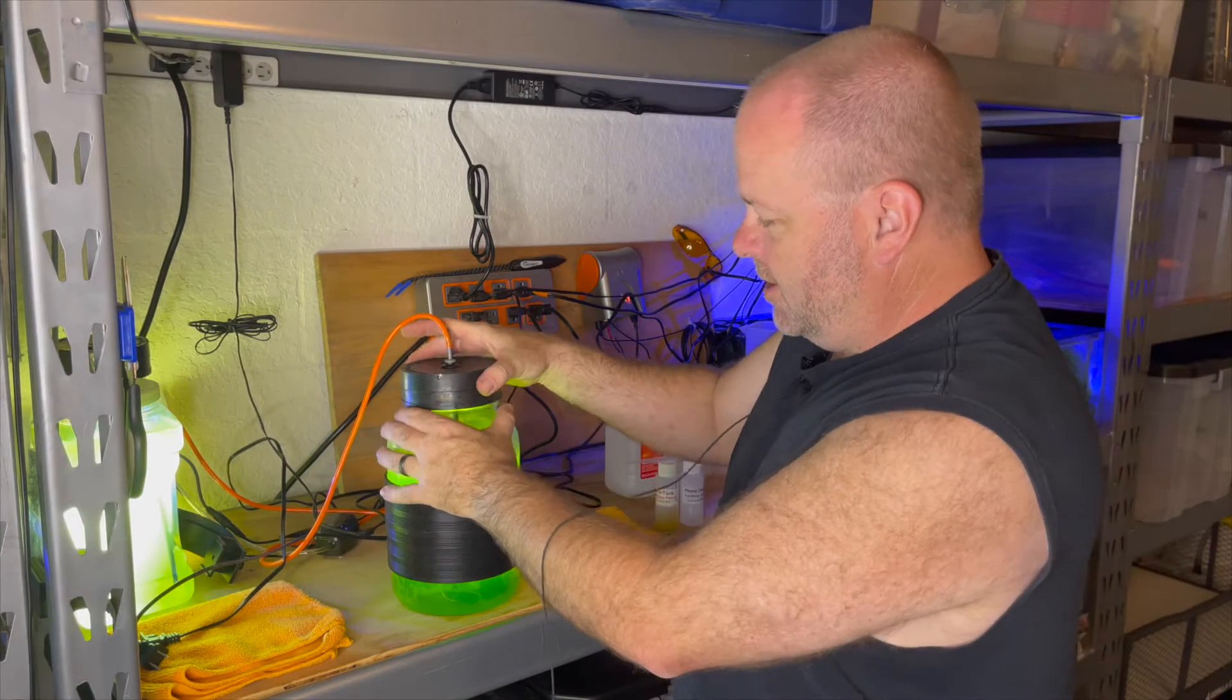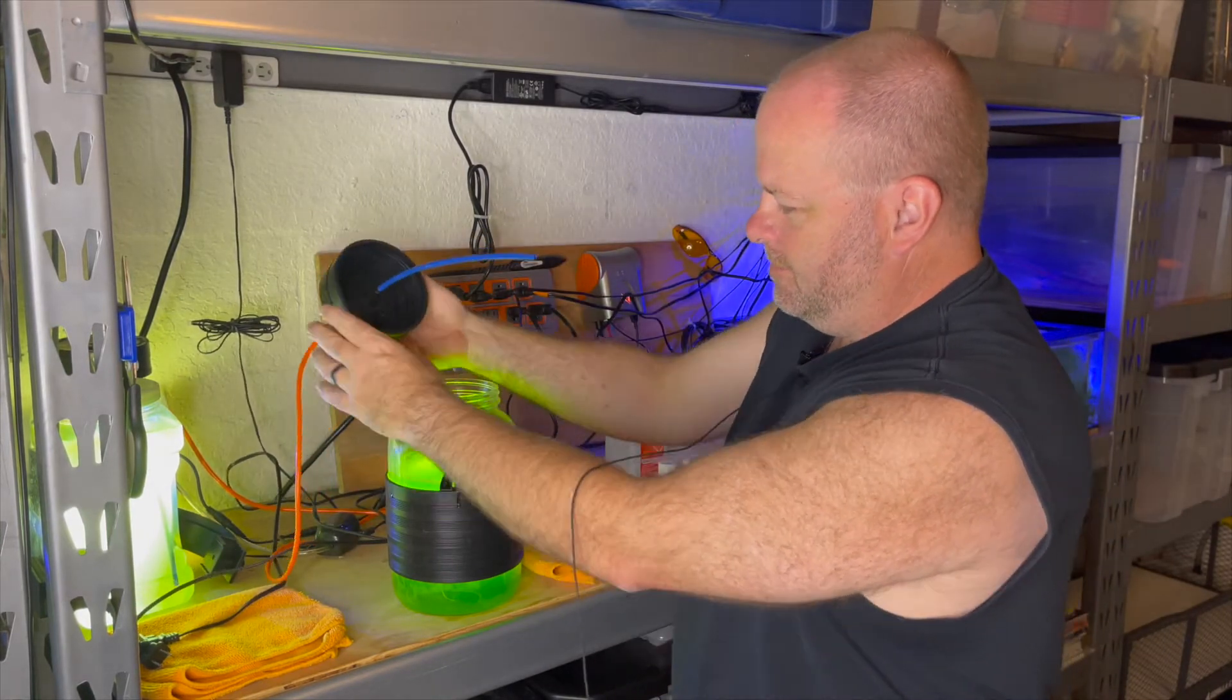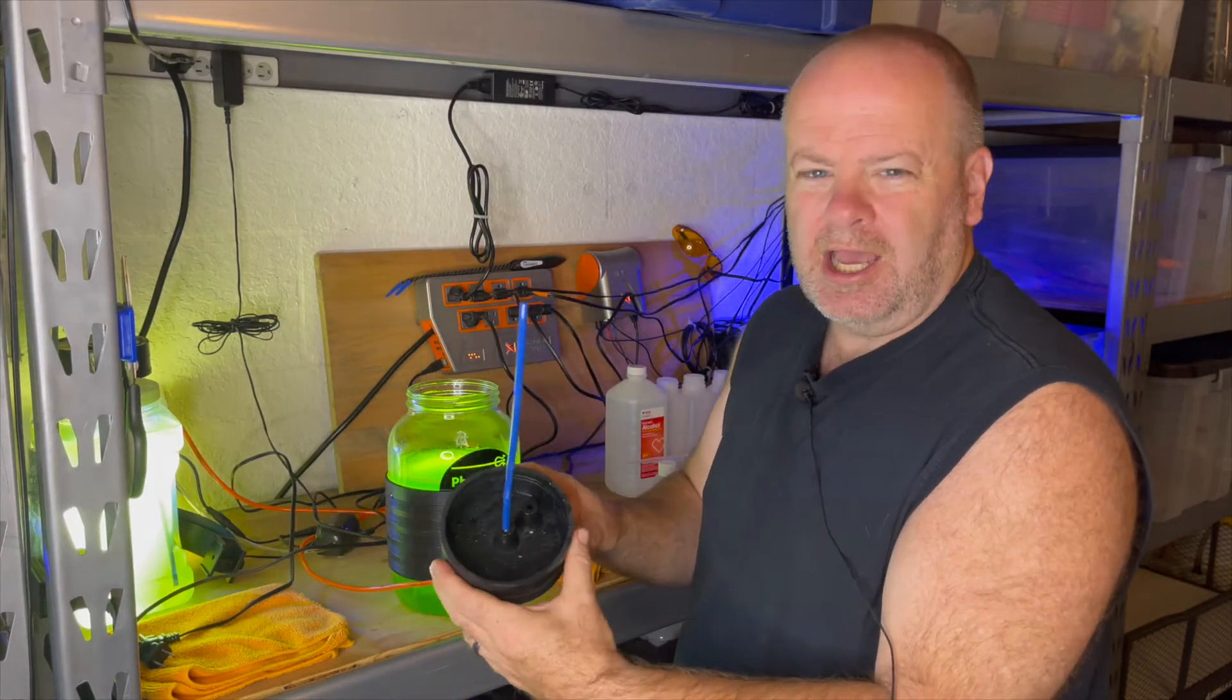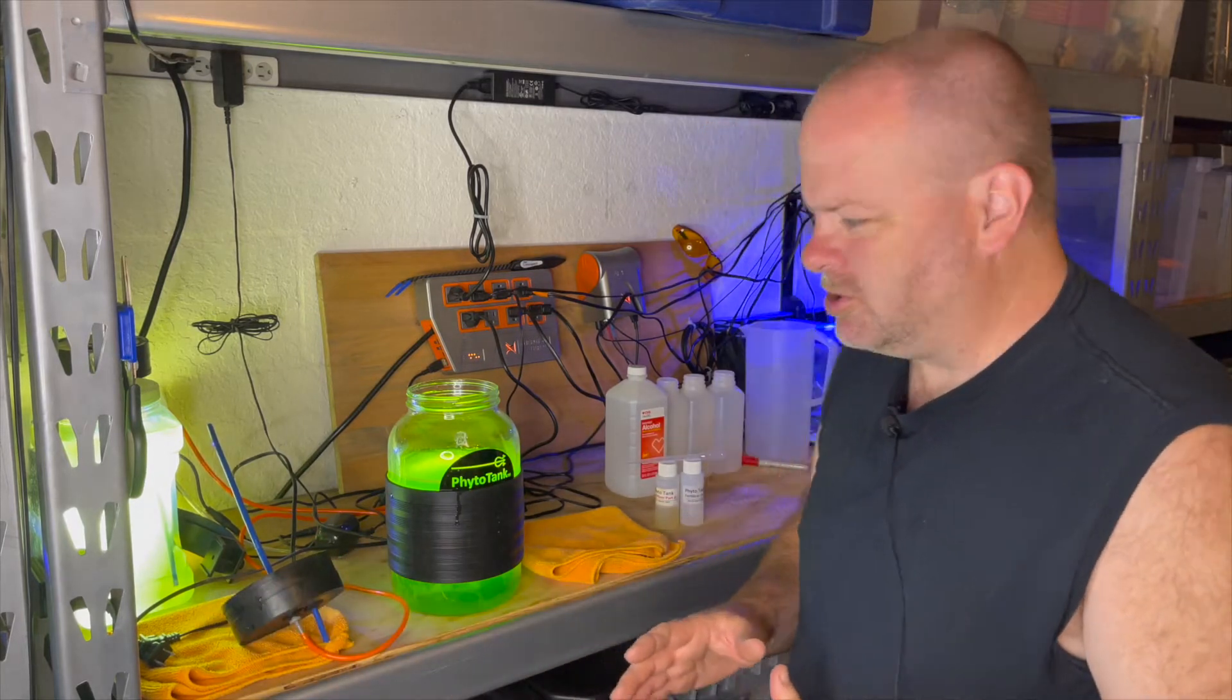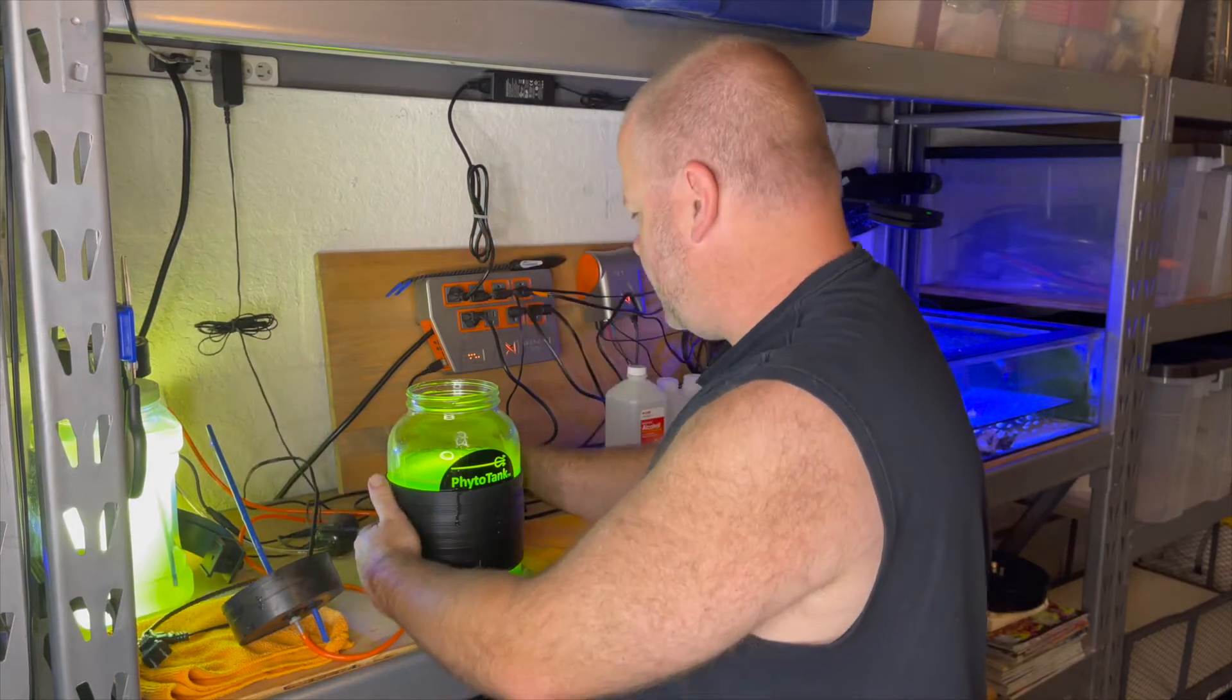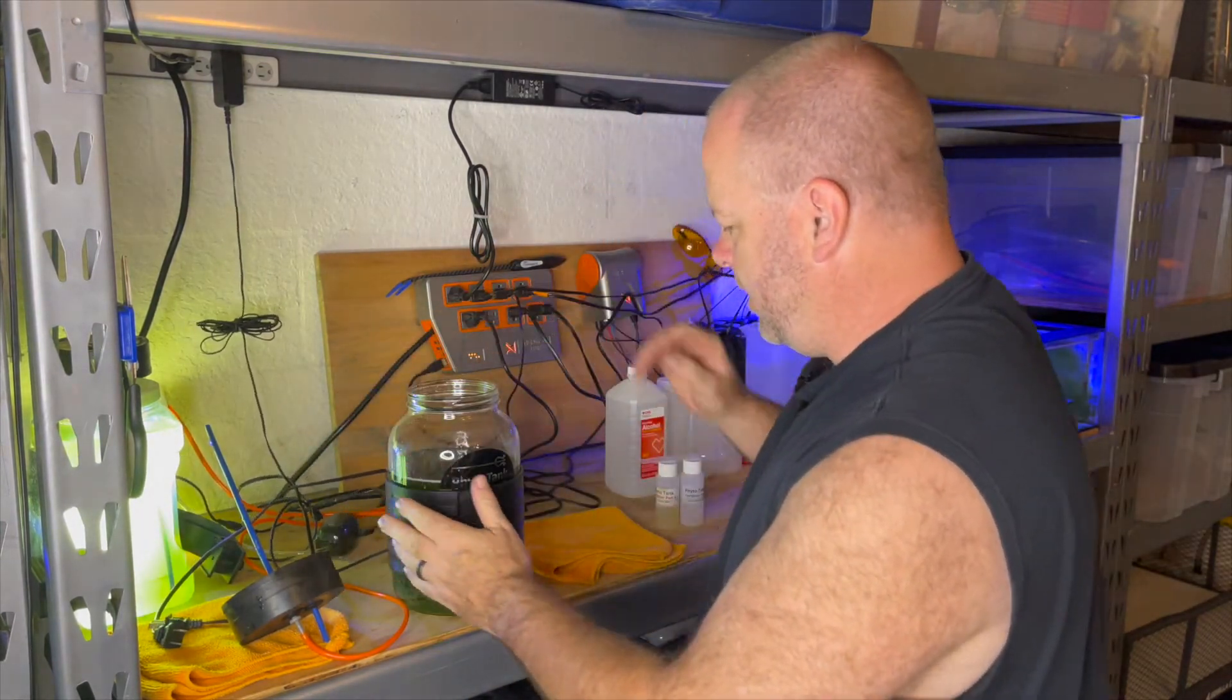What I'm simply going to do is take the top off. Now it will drip a bit. I'm going to put that to the side. Now it is suggested that you clean this each time. You use a new hose. I find that I can get away with two or three cultures before I have to do that. And I'm going to unplug this as well if I can find the correct cord.